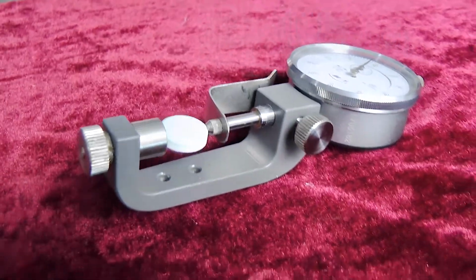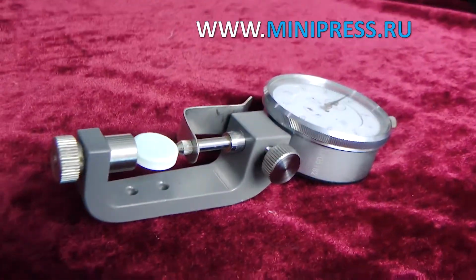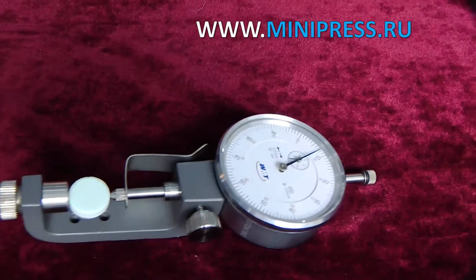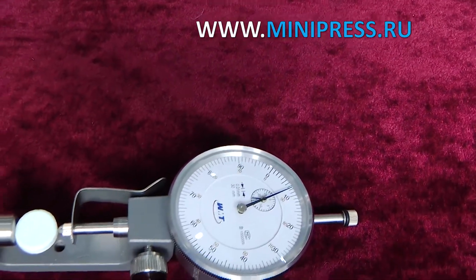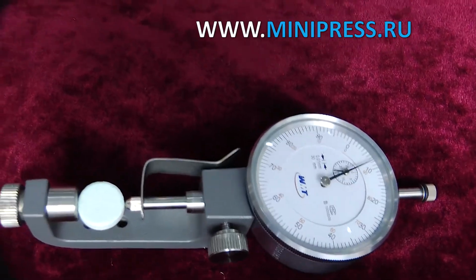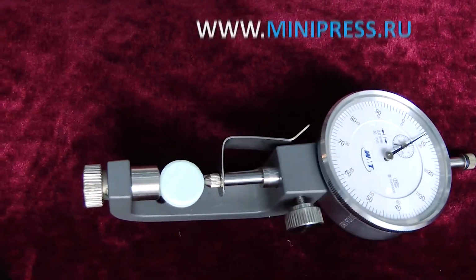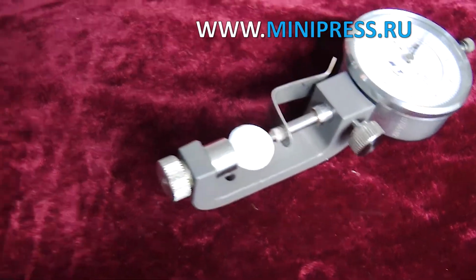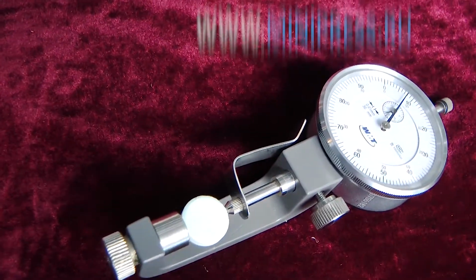analytical and laboratory equipment. Using analytical equipment, they monitor the readings of moisture level, melting time, transparency, dissolution, hardness parameters, thickness, viscosity. Many analytical operations to determine the quality of raw materials and finished products we conducted on technically obsolete laboratory equipment, which often did not provide indicators of verification.